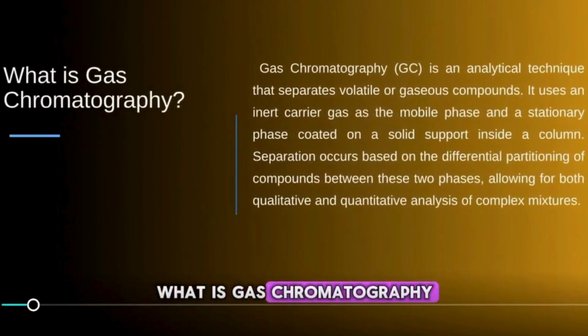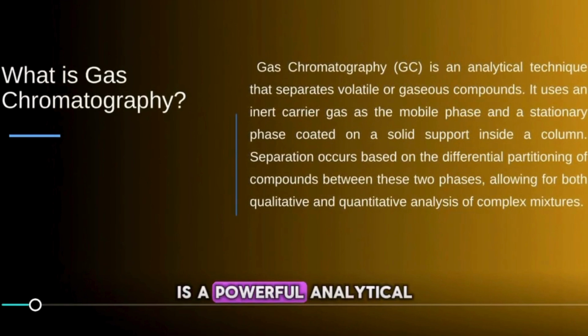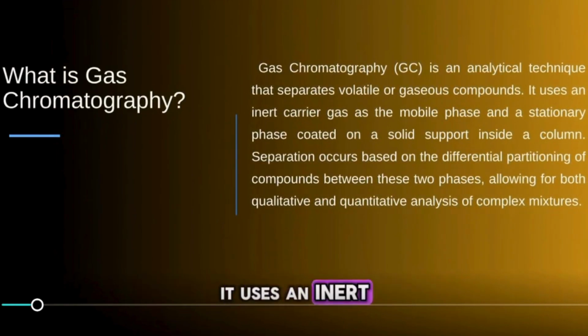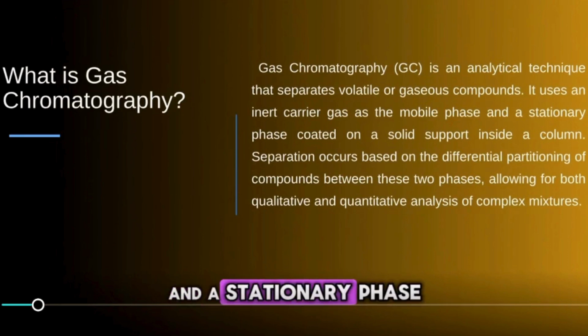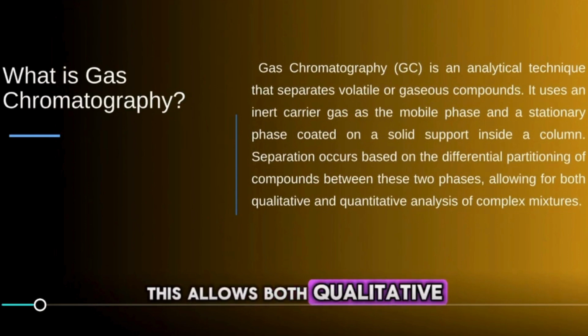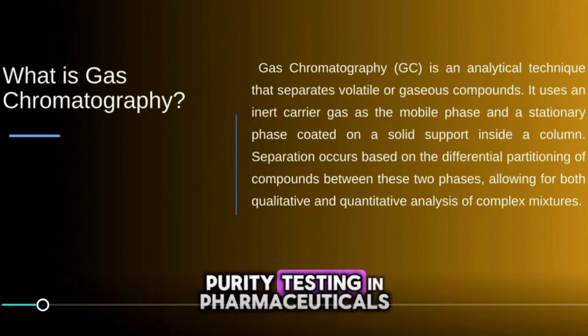What is gas chromatography? Gas chromatography, or GC, is a powerful analytical technique for separating volatile compounds. It uses an inert carrier gas and a stationary phase to achieve precise separations. This allows both qualitative and quantitative analysis of complex mixtures. In short, it's the backbone of purity testing.